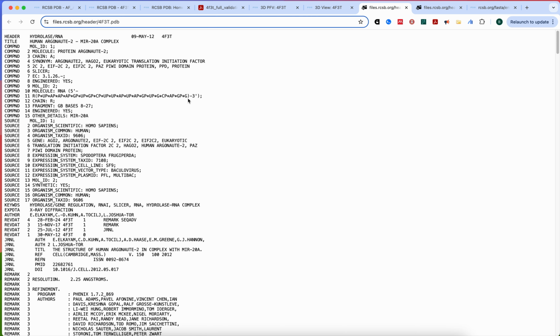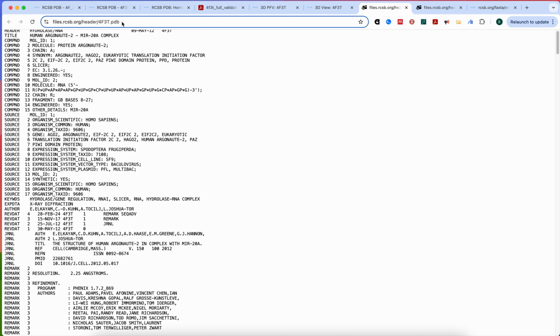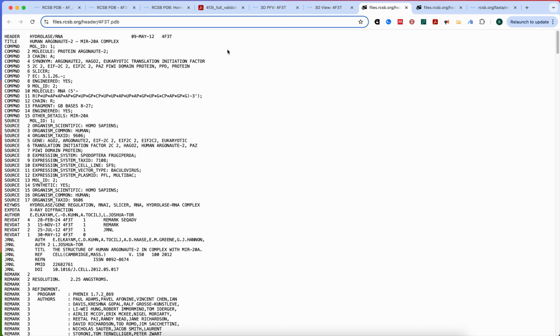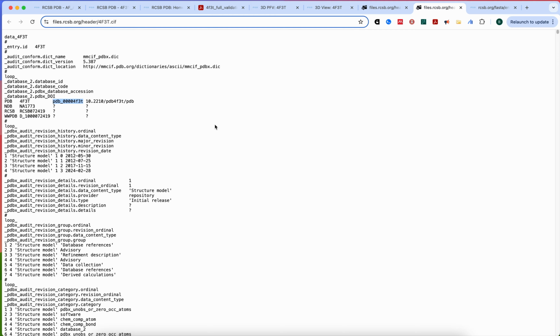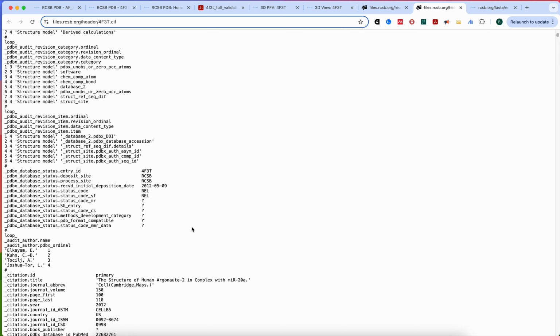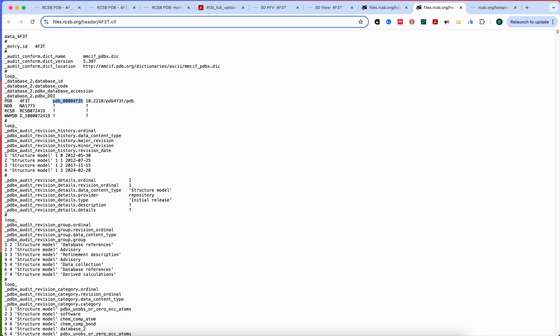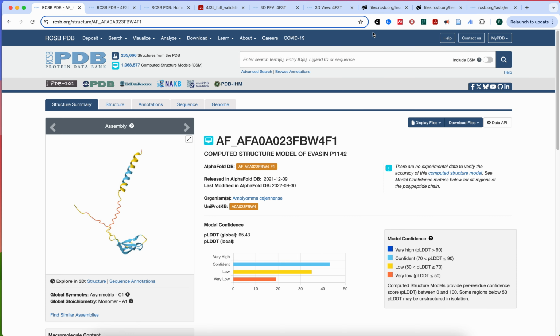So just like the PDB, this is a PDB.pdb file. This is the legacy PDB file, and you can see sort of the format like this. It's very set. Whereas with the mmCIF, there's more room for expansion, and you can have longer entries and things. So more on that elsewhere, but that's the gist.